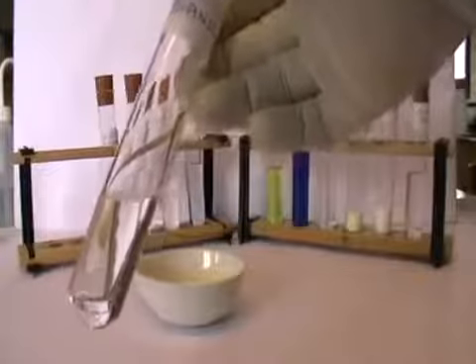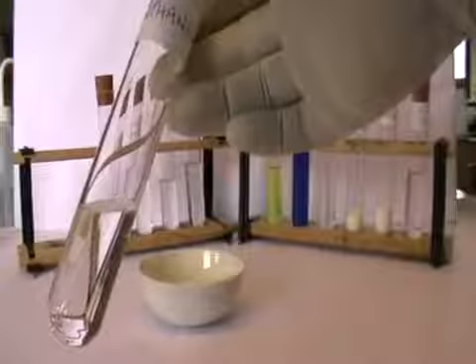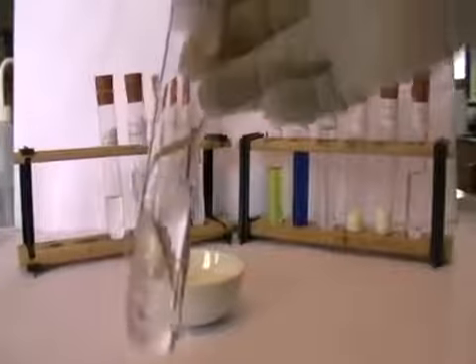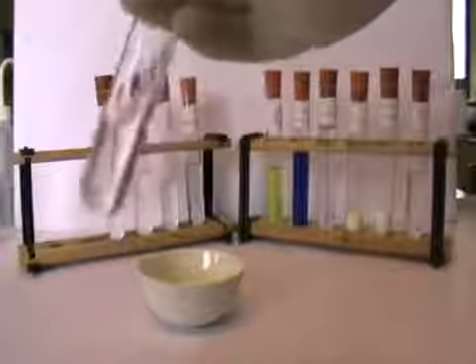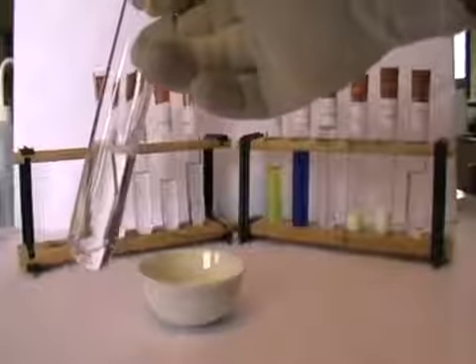So as I smell that, it can be described simply as an alcohol type smell, or you can indeed describe it as a relatively pleasant smell. That's ethanol. So record that. Ethanol has a pleasant smell. It has an alcohol type smell. If this was a non-known substance, it would be satisfactory to describe it in those terms.